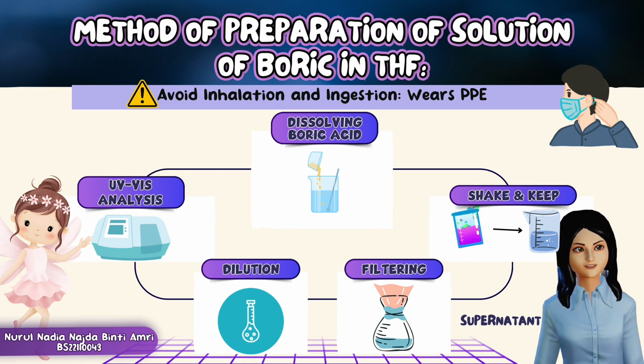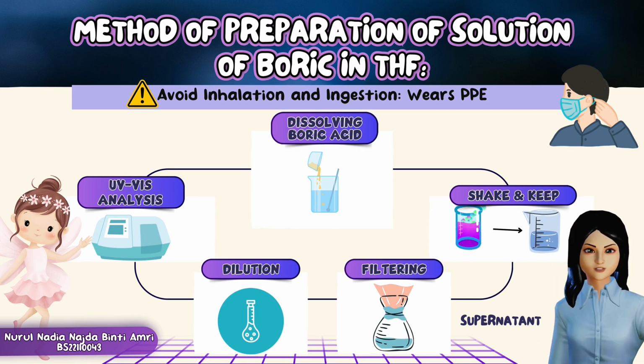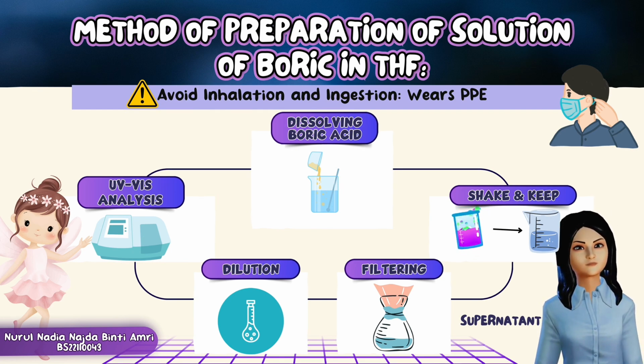Based on the UV-vis spectra, the aqueous boric acid solution gave negative absorbance in its UV-vis spectrum except for the concentration of 0.67 mg/ml. This is most likely due to the formation of polyborates at higher concentrations in water, and thus gave a negative absorbance at higher concentrations.